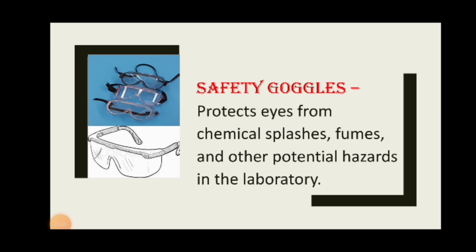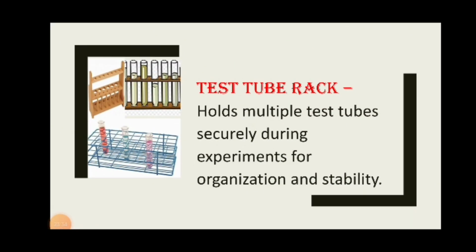A lot of accidents happen inside the laboratory. Without using goggles, your eyes will eventually be damaged by an accident or whatever. No, hindi na ba pwede. We cannot replace our eyes, so that is why maybe we can replace, but it takes a lot of time, money, and etc. But to prevent such a thing, we have to use goggles, no? Ano lang.